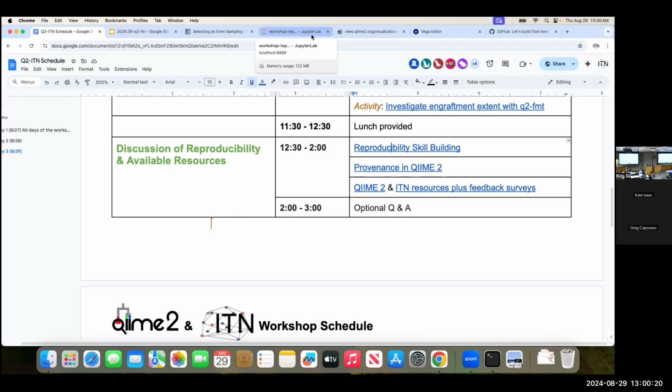All right, well then you're up next, because it was a lot, right? There's a lot of details and a lot of different commands that we ran. And I would be challenged even a few days from now to come up with those commands by heart. And so that really brings us to a tool within our tools called Provenance Replay.